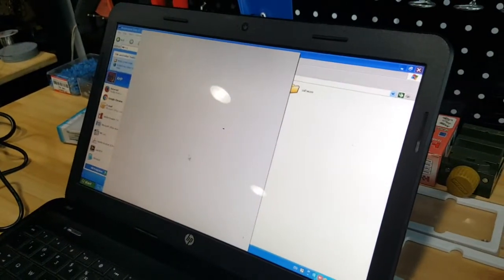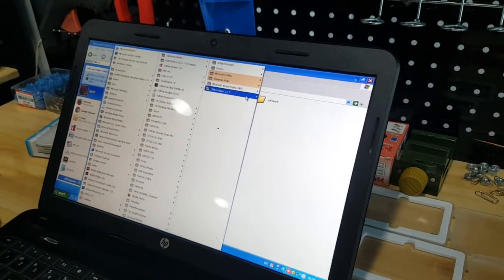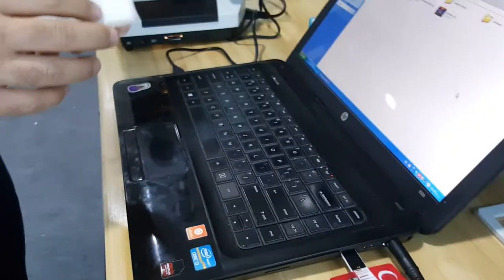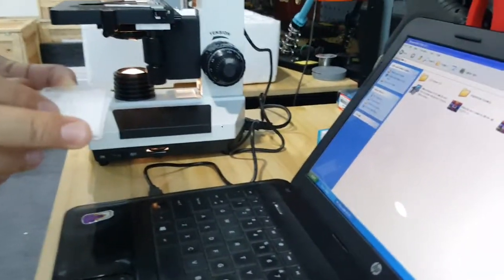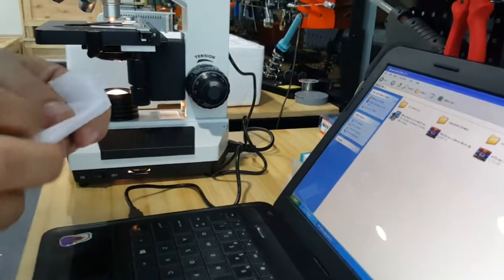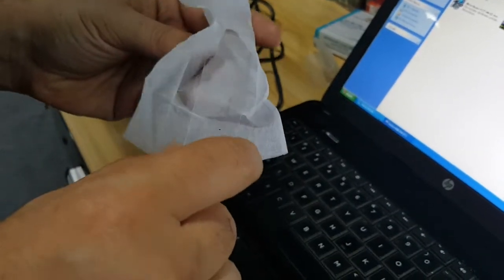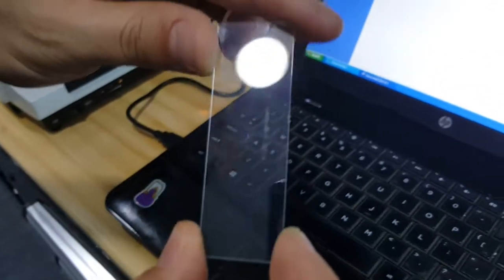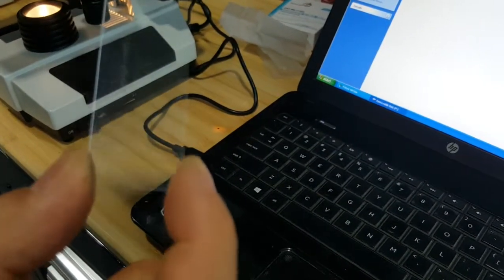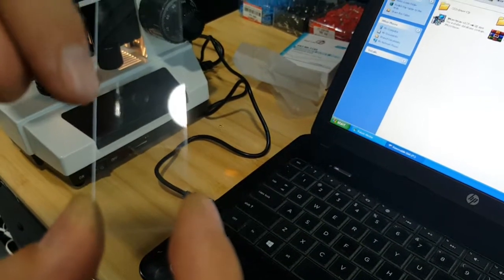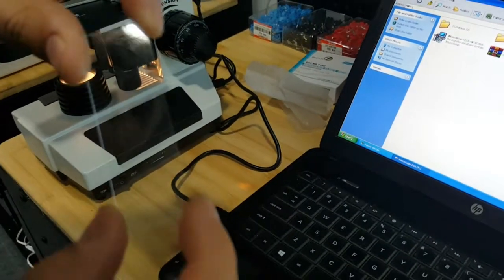Now we have J Micro Vision open. The first thing we need to do is calibrate the pixels of the pictures coming into the computer. For this purpose we have a calibration slide here. You can see there's a mark in the middle of the glass slide — the total length is about one millimeter and one division is 0.01 millimeter, that is 10 microns.